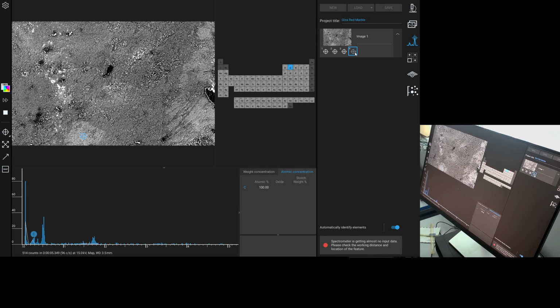And this light grey area, again, it's struggling, it's really struggling. So close. So the difference is that some areas have some aluminium and some sodium in there.